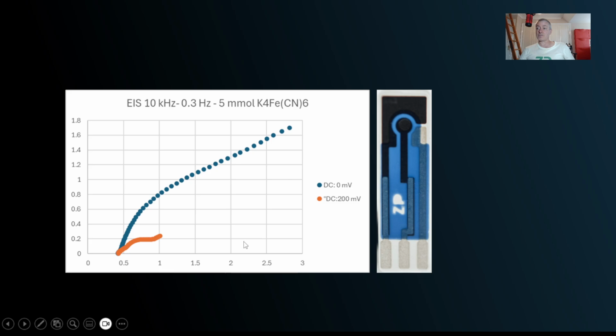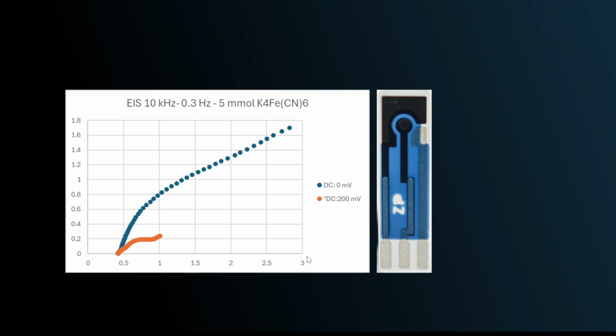It's actually quite satisfying, because I realised that their solution resistance has stayed the same, which I would have hoped for, because with the solution resistance they are measuring the solution resistance, and so they should have consistency whether they're doing it at 0 millivolts or 200 millivolts. And so they do have a good consistency. So I'm quite happy with that, and they're quite happy that they get better data with the 200 millivolt offset. So I think we've essentially answered their question.